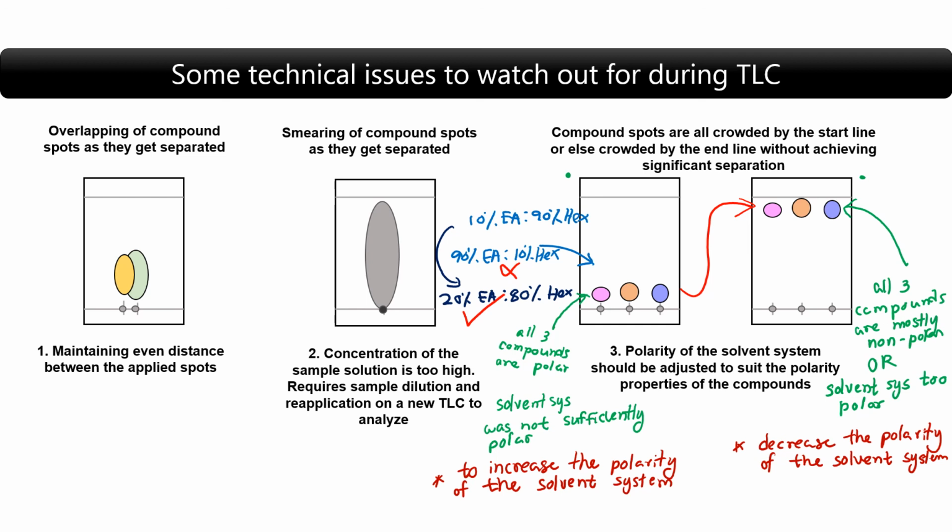So these are actually the different types of questions you would expect in the exam. You will be given either some technical issues or cases where the compounds did not separate as expected, where the student was not able to obtain a significant separation among the compounds, and what would be your solution to rectify that problem.